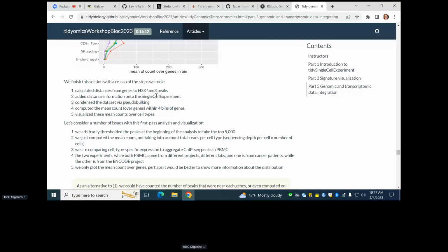Yeah, I would reiterate. You have seen that all this is very sexy and will save you a lot of hours of work. It's the same thing as tidyverse versus base R. Having said that, you never lose any Bioconductor tool, as we said. You can switch anytime for operations that are more convenient with some other grammar. So basically, you don't lose anything. We bridge to the tidyverse, which is huge for you to use, if you want to.